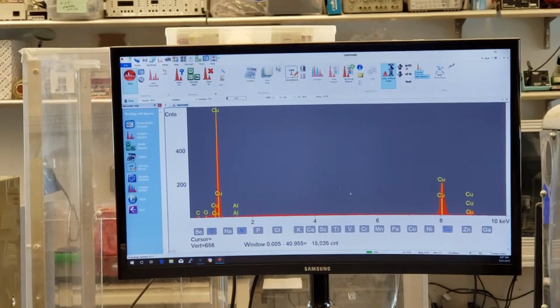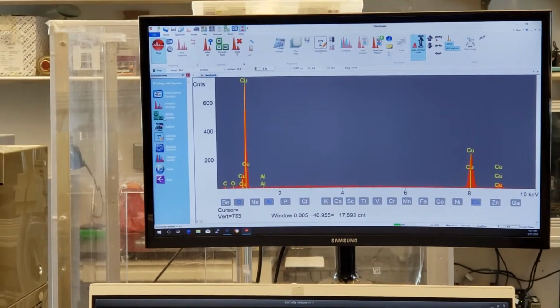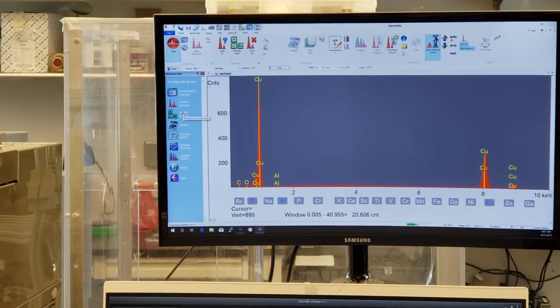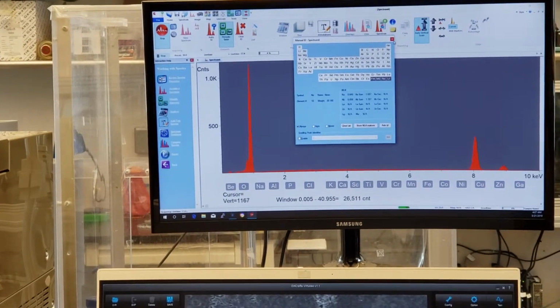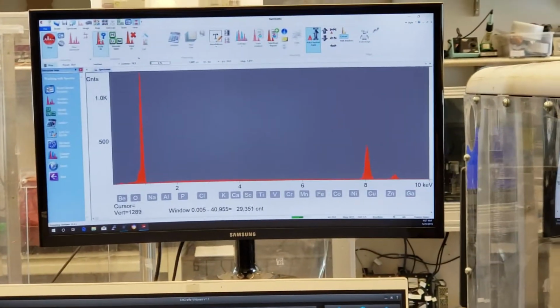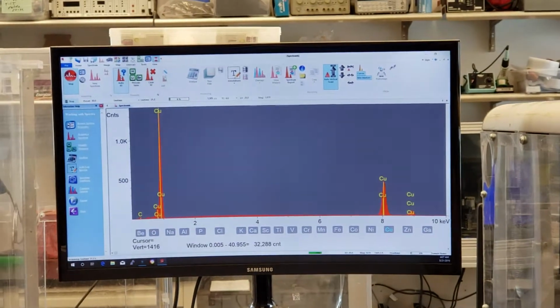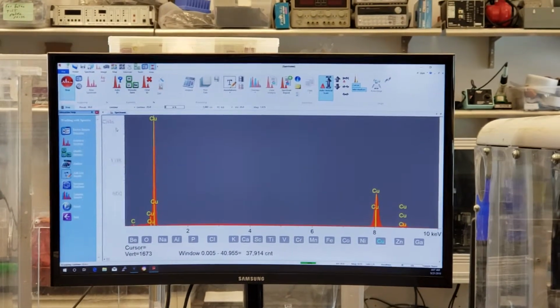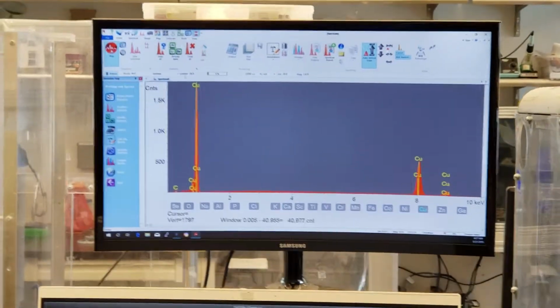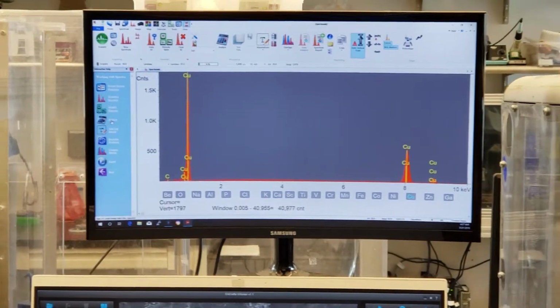Again, remember the labels from previous, but if I call up the periodic chart, right, and I clear this list, I cleared it all, right, and if I go back and just click on Auto ID up here, it'll go in and relabel everything up on top, right? So collect the spectra, ID it. I'm going to stop it after 26 seconds, right? I stopped it, and then analyze it.